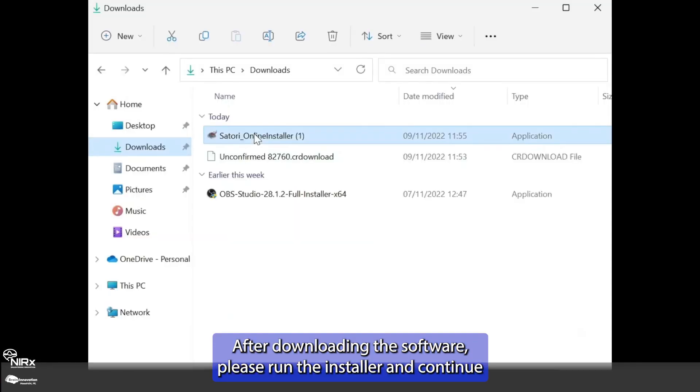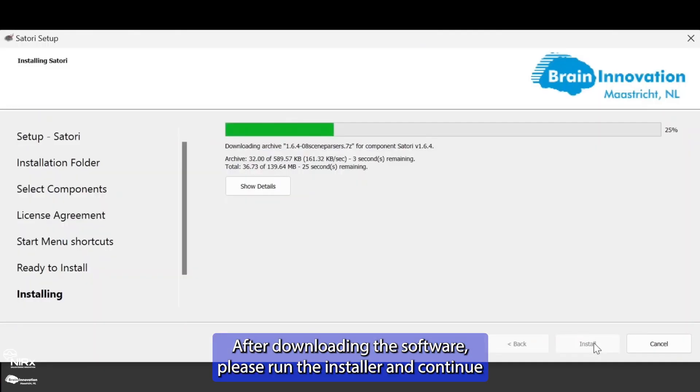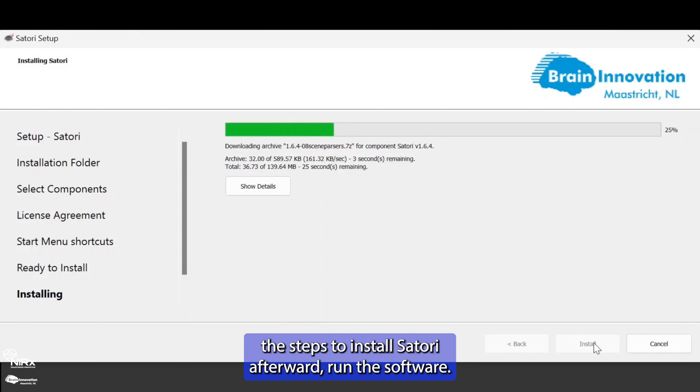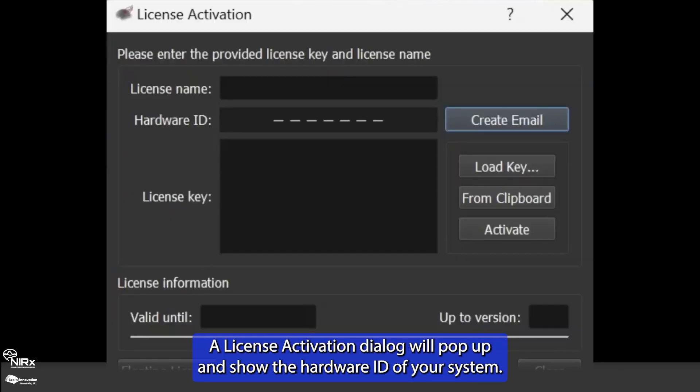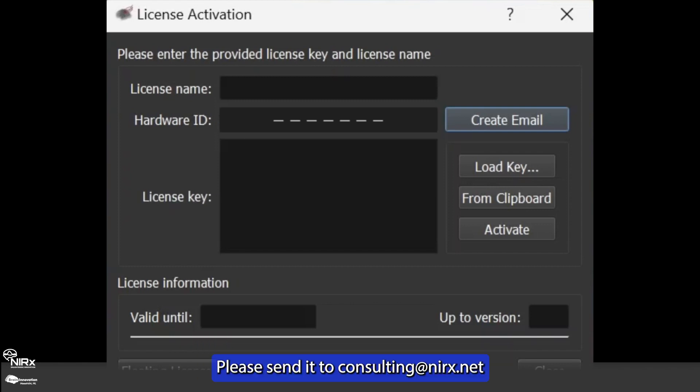After downloading the software, please run the installer and continue the steps to install Satori. Afterward, run the software. A license activation dialog will pop up and show the hardware ID of your system. Please send it to consulting at nirx.net so that we can create a license for you.